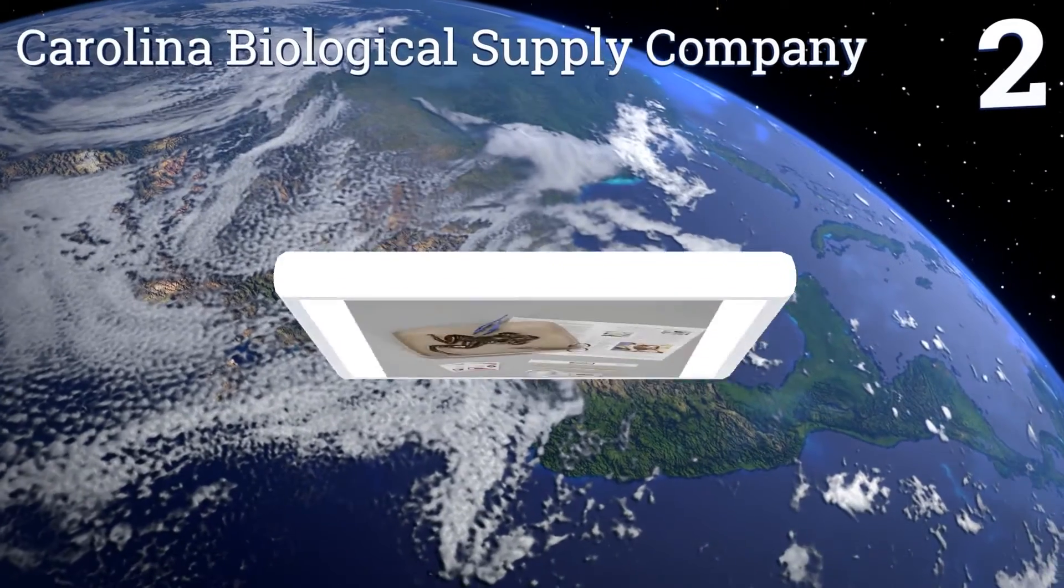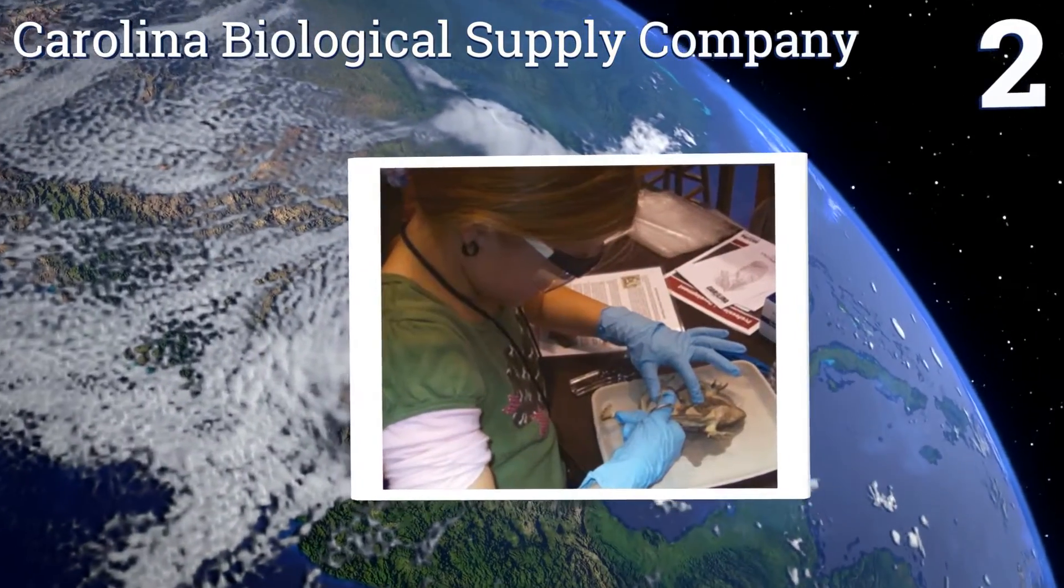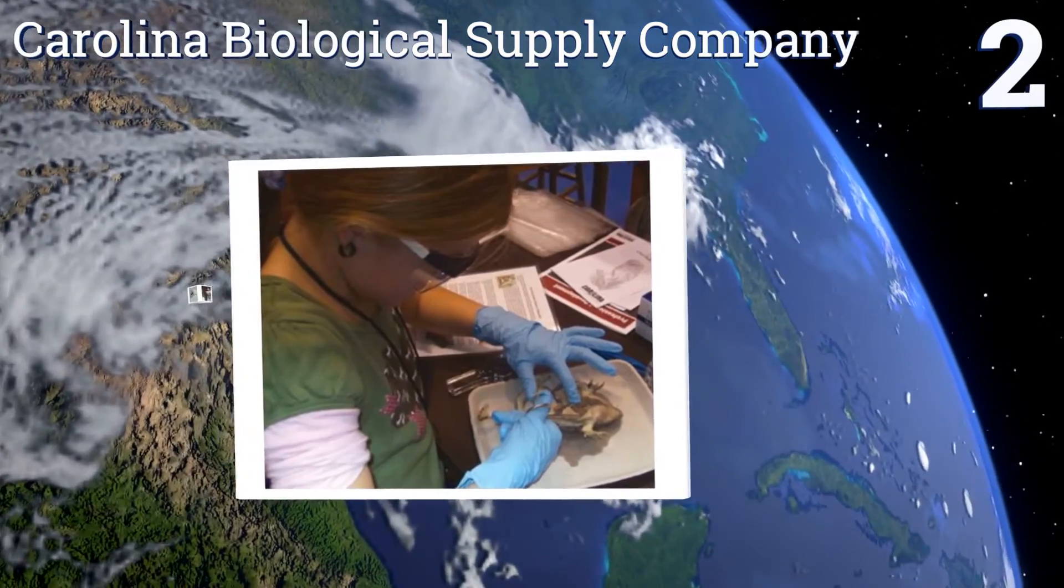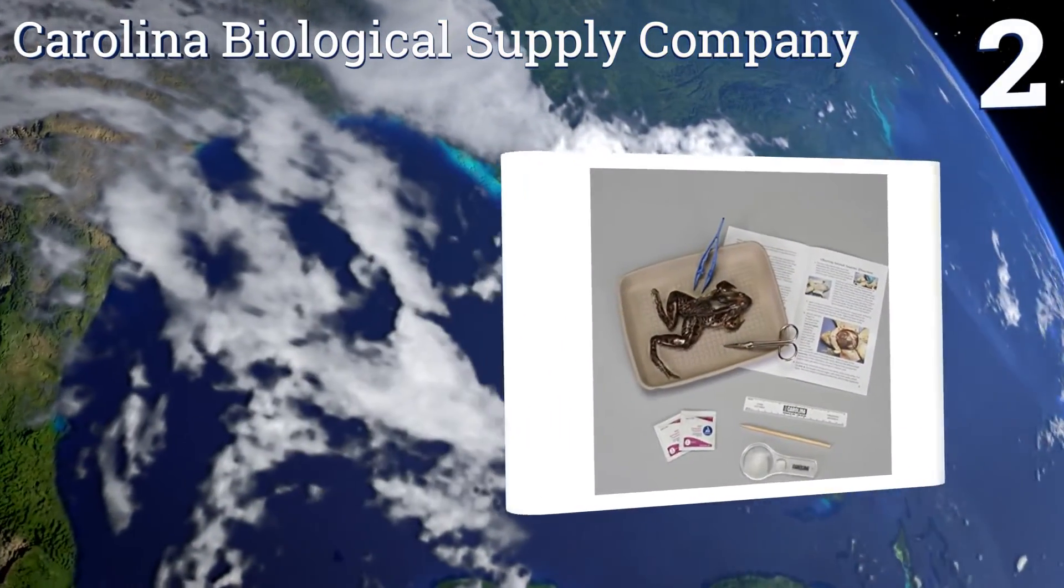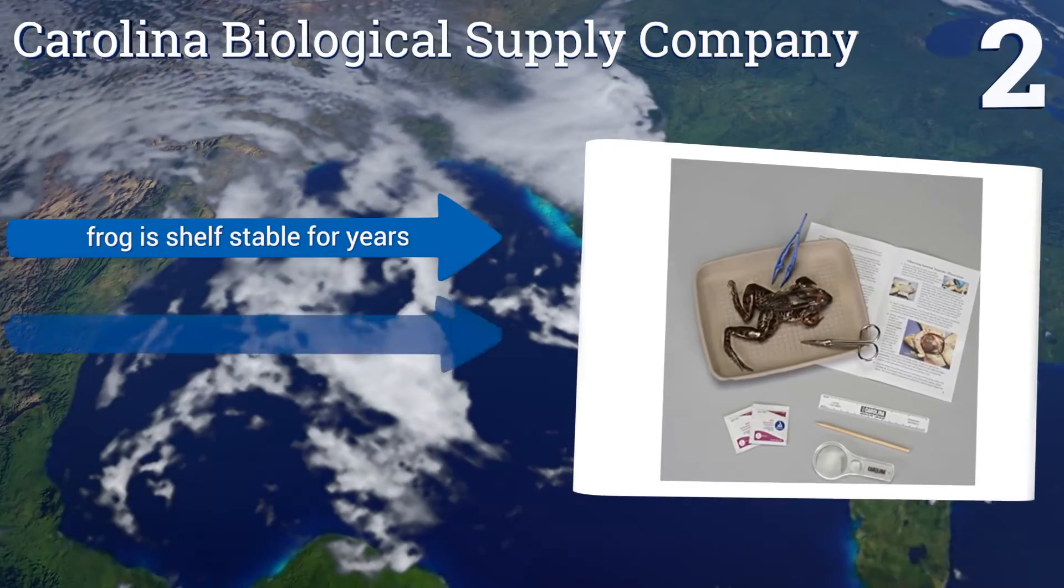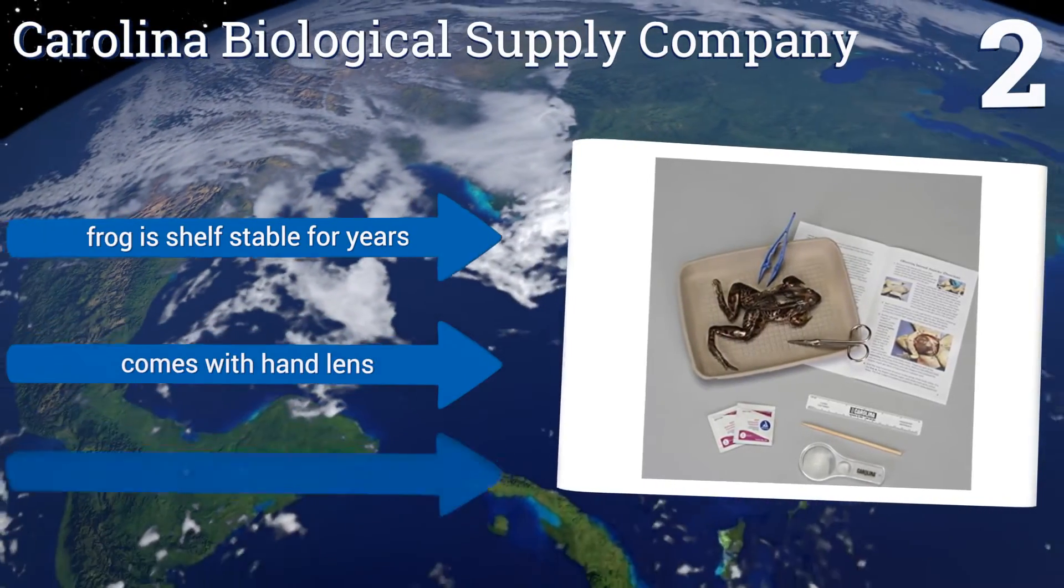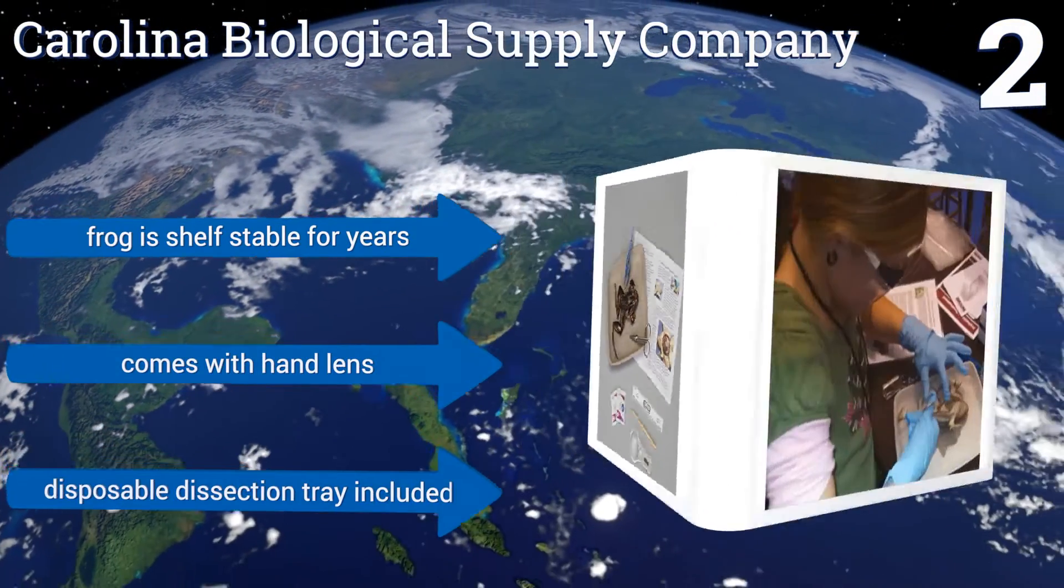At number 2, this Young Scientist's Frog Dissection Kit from Carolina Biological Supply Company comes with everything you need to dissect a frog, including an actual preserved frog's body. It's a convenient option for the high school biology classroom. The frog is shelf-stable for years.